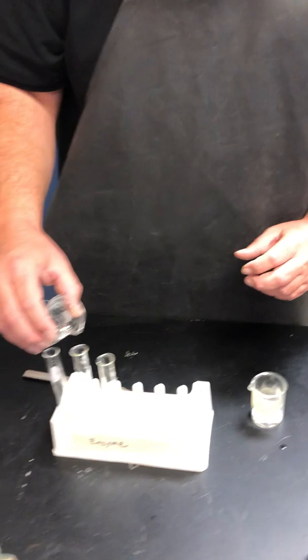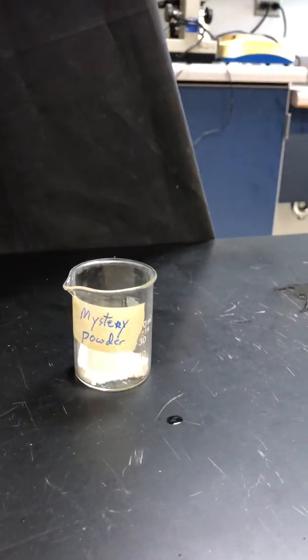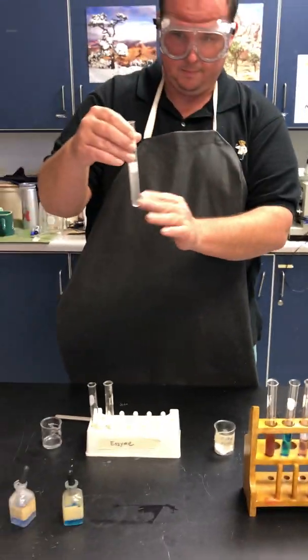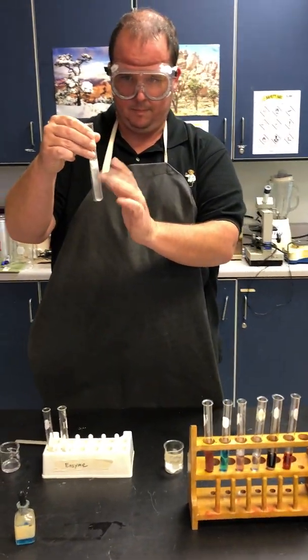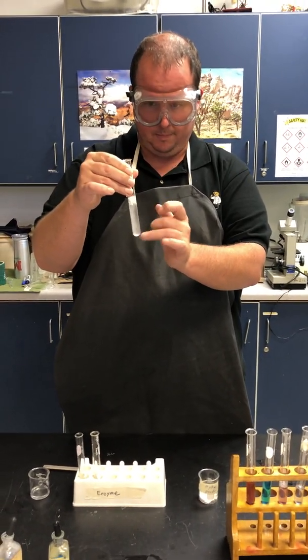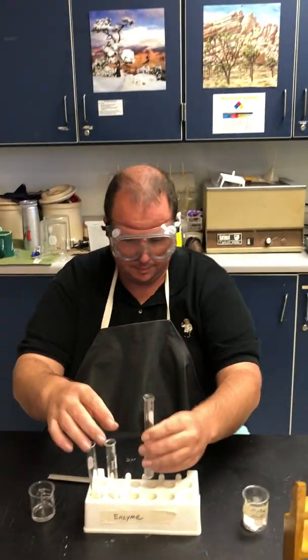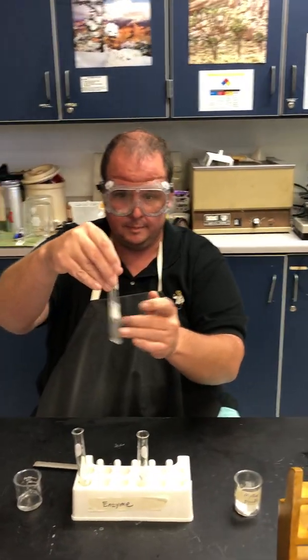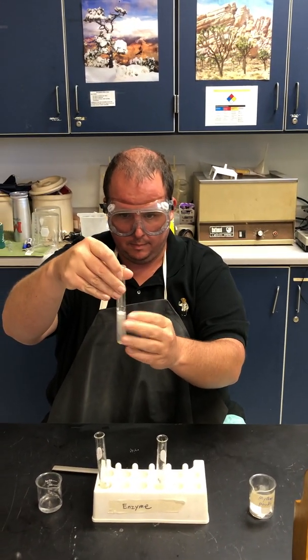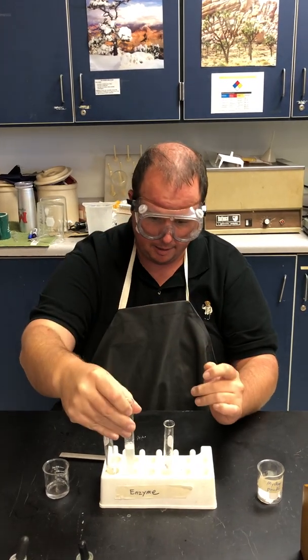So the question is, which ones of them did I put into this mystery powder, which is a white powder? We don't know what's in it. So Mr. Bouchard, who is so talented, is going to test the mystery powder one at a time for each of those substances, because there is an indicator chemical that allows us to see a color change if each of those things is present. So I'm just trying to mix them a little. You're doing great. Thank you. Very good technique.